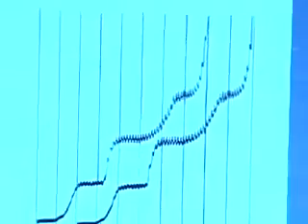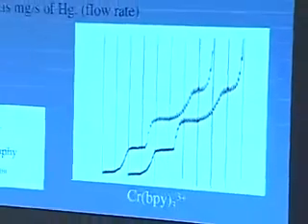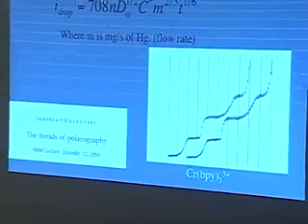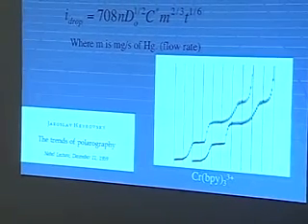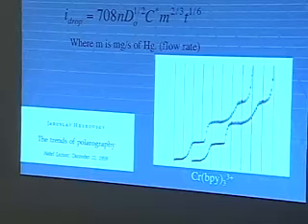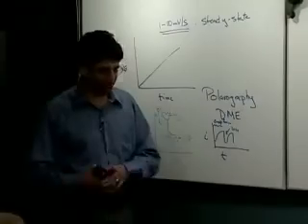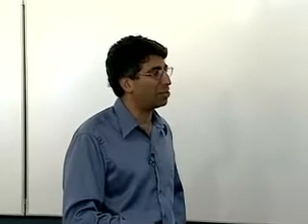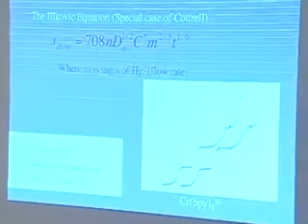But it occurs to me that what's happening here is he had a very slow, we'll call it strip chart recorder, amazingly slow. And it probably could not keep up with the fall off in current, in particular when the drop fell off. As that drop was dislodging, his recording mechanism couldn't keep up with that. So his lines probably shoot way down on the page, these vertical lines, but you just can't see it. So this is a good example of where poor equipment can actually help you out.